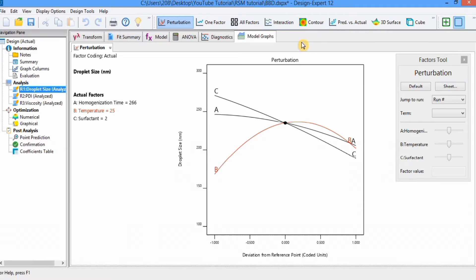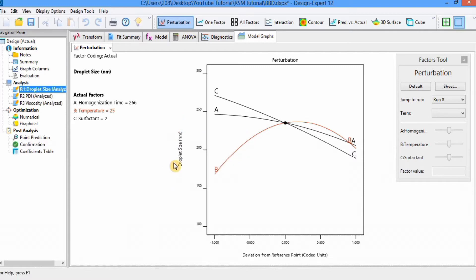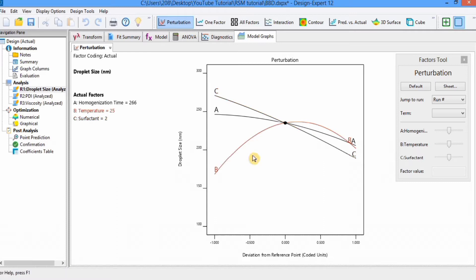First we will look at the perturbation graph. This graph shows which factor mostly influences your response. Currently we have selected droplet size, and it shows that factor B has the most influence. If you click on any line you can see its color changes. You can easily observe that factor B has more influence on droplet size compared to factors A and C.